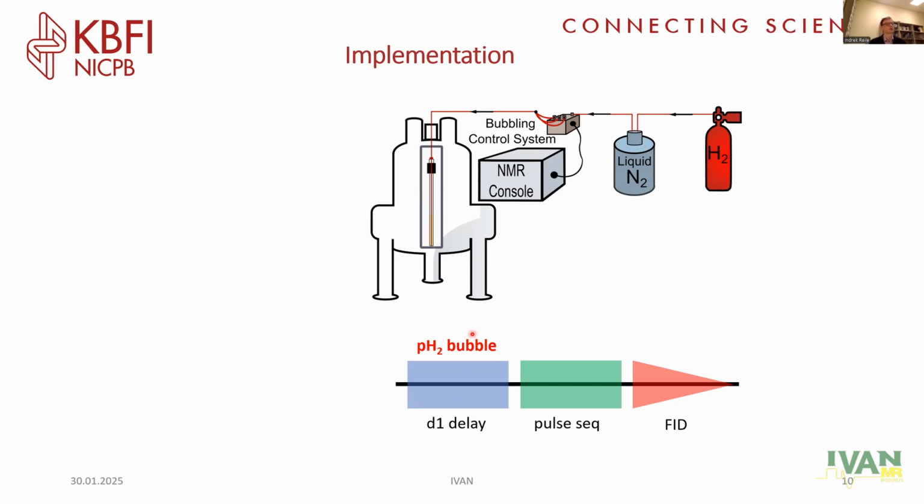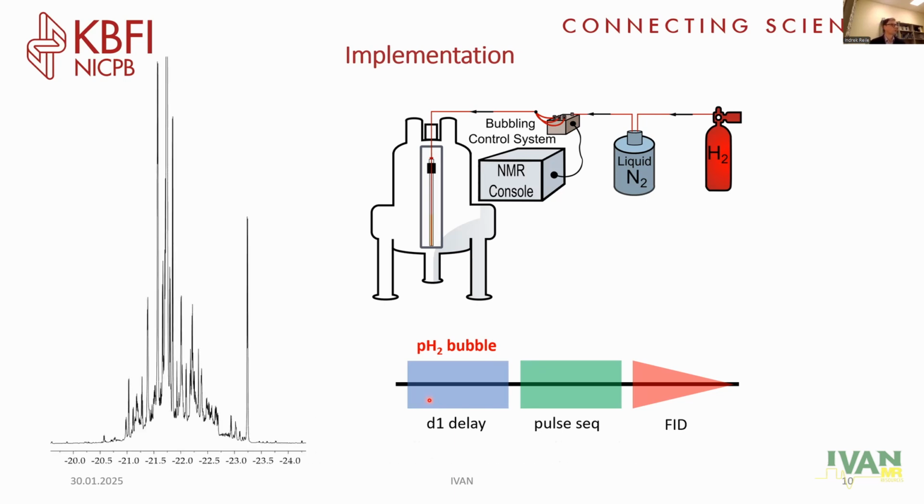And in general, the logic of NMR remains the same. There is no field cycling, no movement of the sample. And a lot of methodology development for pulse sequences like this is still happening actively at Radboud University with Marco Tessari.